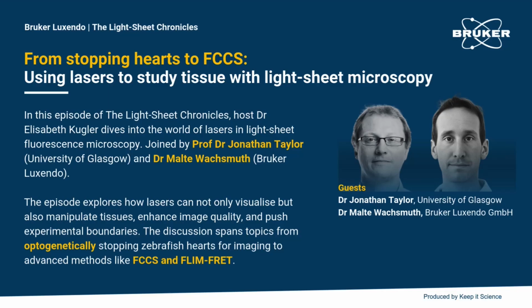But then you've got the additional challenge of doing FLIM-FRET in a much messier in vivo environment with a lot of other background fluorescence in there as well. And in our case, where we want to do this in the hardest place possible, the heart, you've got the additional problem of the moving tissue. The reason we want to do this is that knowing what these intercellular forces are is absolutely crucial for morphogenesis, both in terms of the mechanical forces that the cells are under, but also how the cells are responding to those forces, as well as basic questions about heart function and how those cells are interacting collectively together and the force that they're generating spontaneously.